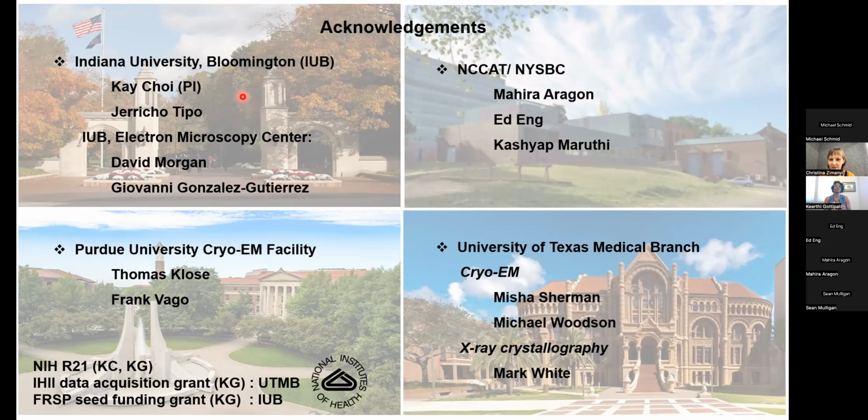I don't know if there are any tricks to actually get rid of this. We pretty much end up losing a lot of particles when we do the averaging and 2D classification, which is probably why we also need a lot of particles to begin with. The 2D classification screening at that stage gets rid of most of those particles. Some of the 2D classes, we see two particles in one class, and we get rid of all those classes.